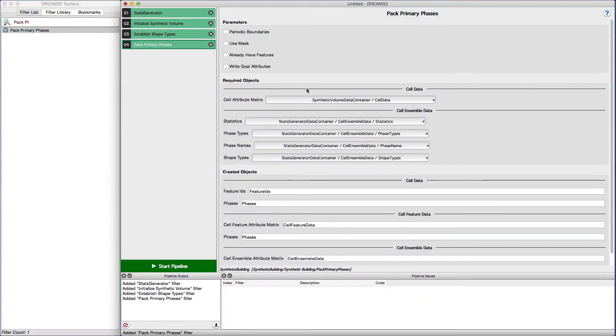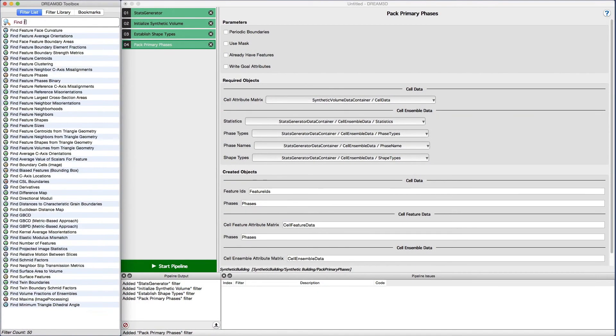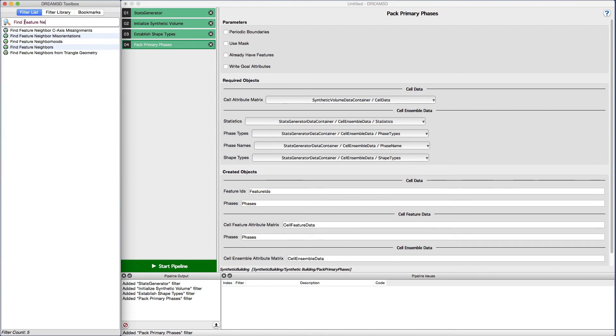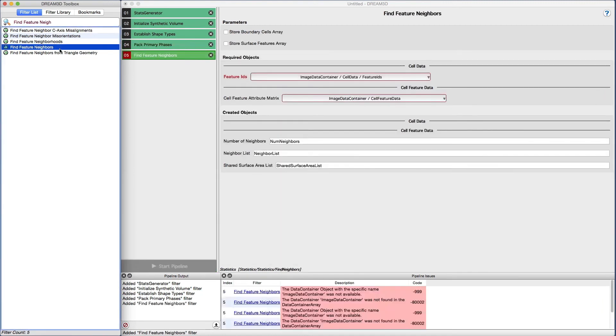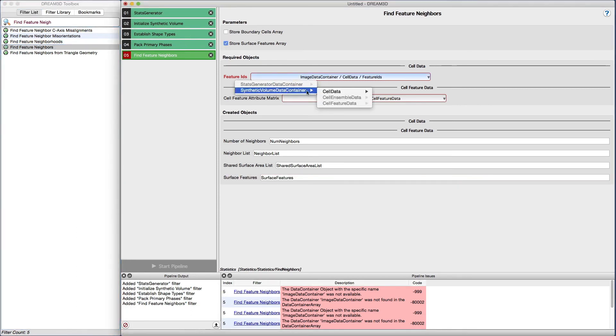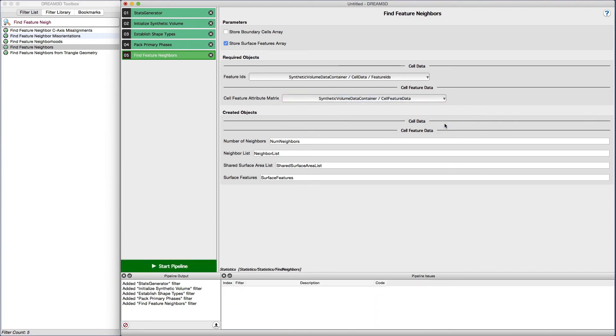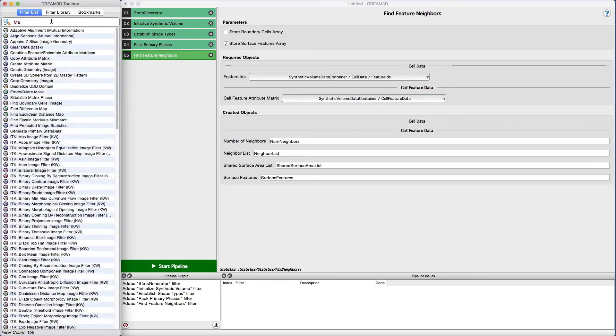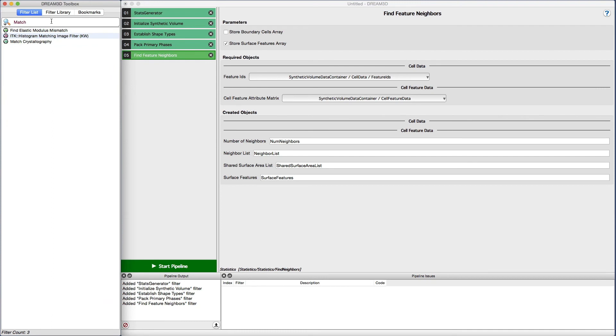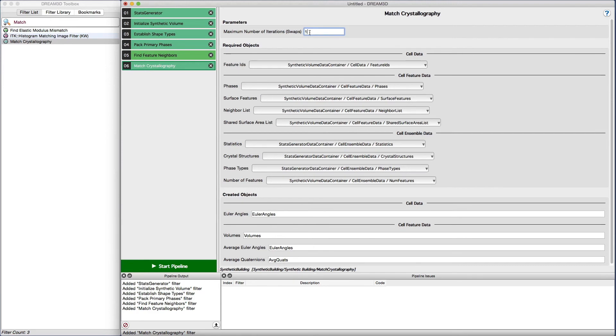The next filter to add is the find feature neighbors filter. With this filter we have some selections to make. We should select the store surface features array and select the proper feature IDs and cell feature attribute matrix values. The next filter is the match crystallography filter. We set the maximum number of iterations to 100,000 and accept all the other default values.